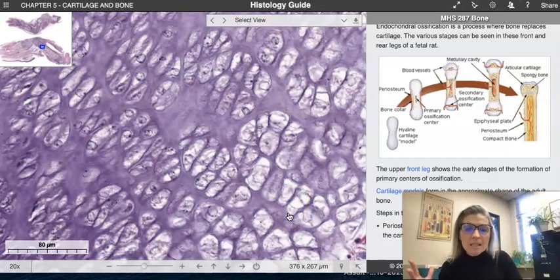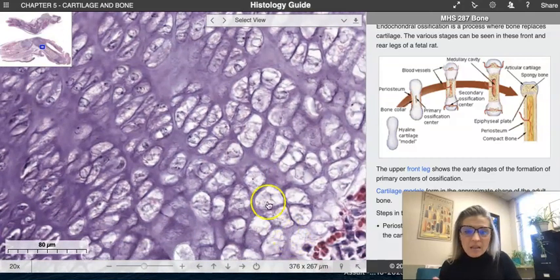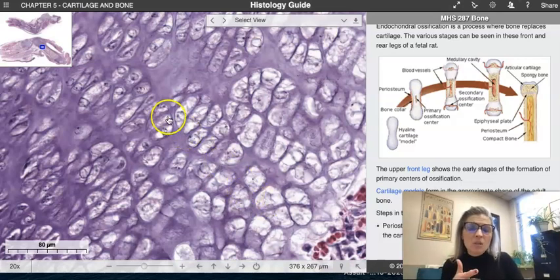So you have essentially what looks like less matrix, this light purple cartilaginous matrix that is here. The cells themselves can start to disintegrate, they can get bigger themselves. There's just this kind of transition, right? In that same section, you can see up here with the proliferative zone, you can see nuclei. But down here, you're like, where are the nuclei? Or you actually might see the cells getting kind of spidery looking as well. That really is the distinction between the proliferative zone and the hypertrophy zone.